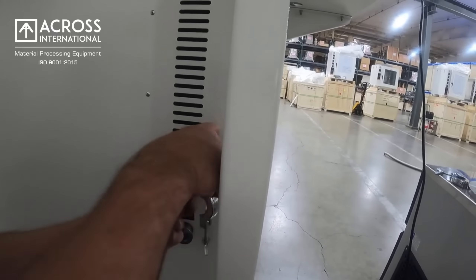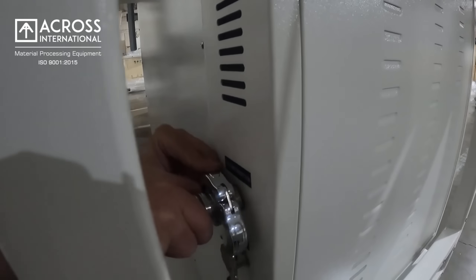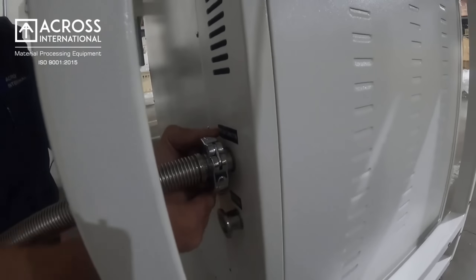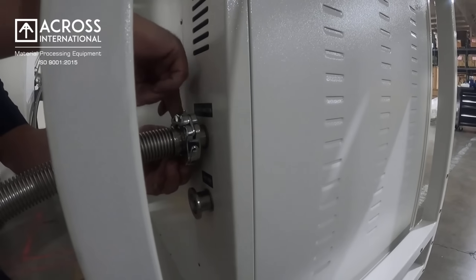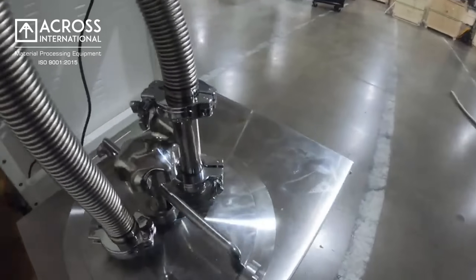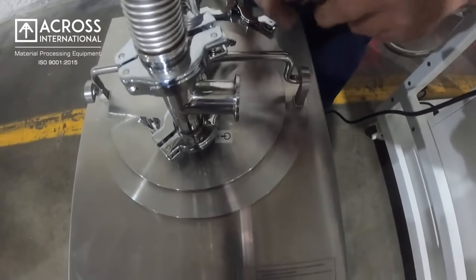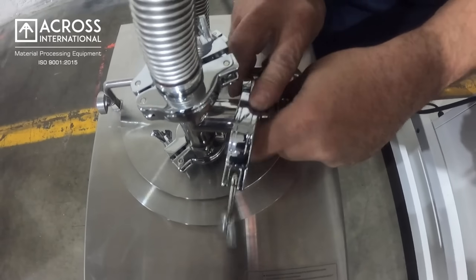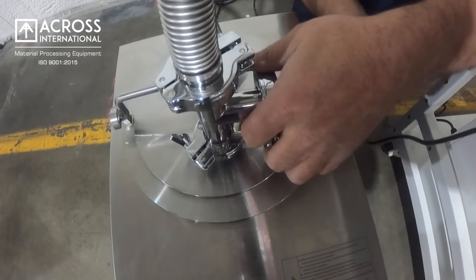Tighten your clamp and seal with your KF-25. The other end of your bellow is going to connect your final connection to your cold trap with the KF-25 and seal. Tighten your KF-25.